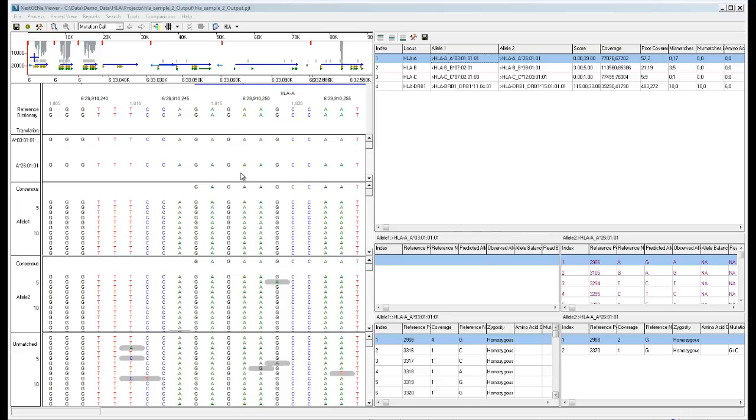On the left, we can see the NexGene viewer's HLA-specific visualization. The top pane is the same as the default view, showing the coverage in gray across all the genes included for the project.